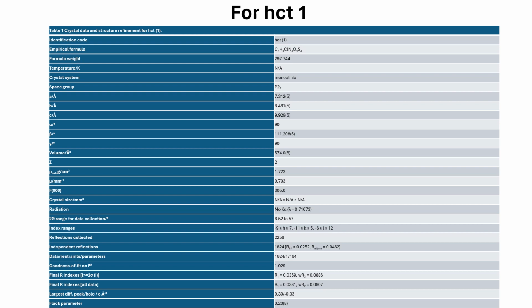To start, we used the direct method, with the option known as solve. There we used the option called program to get the electron density. From the electron density we have to guess the model. What is the actual model? Meaning our proposed one. We have to assume something, and based on our assumption, we proceed. After giving a particular structure from the electron density, we have to check the refinement.